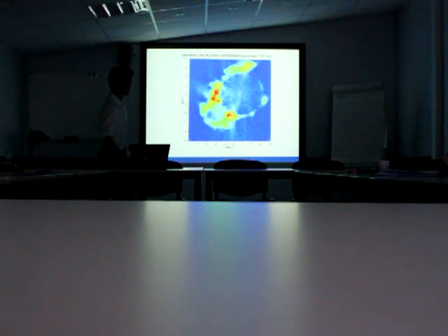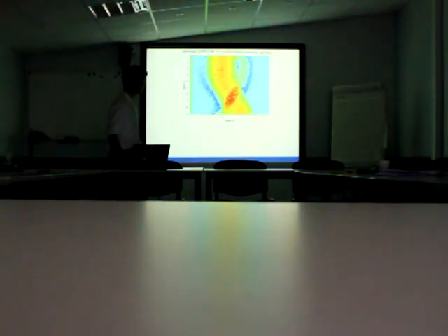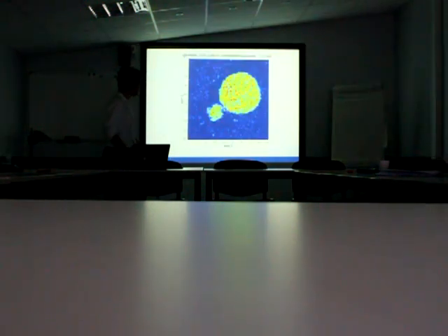Now I think for this one, it's been filtered a bit too much. So I should put in some restriction that if more than 10 or 15% of the image is registered as outliers, you should just reject and do nothing. I thought this was promising for something automated and quick and dirty. So, get some reconstructions, small fractions.